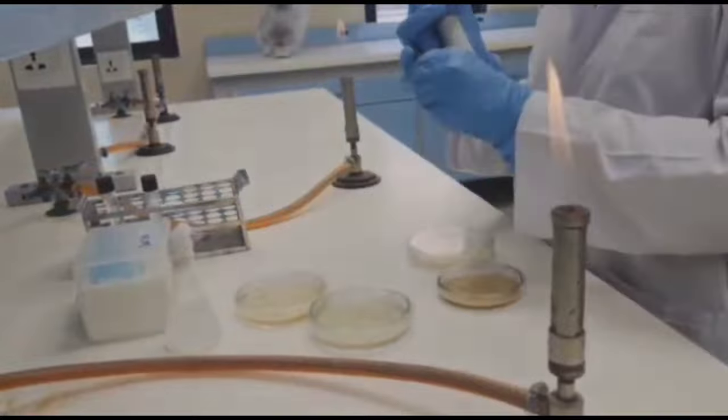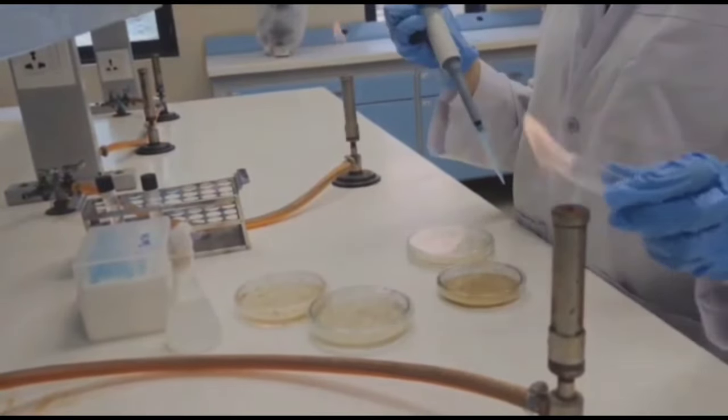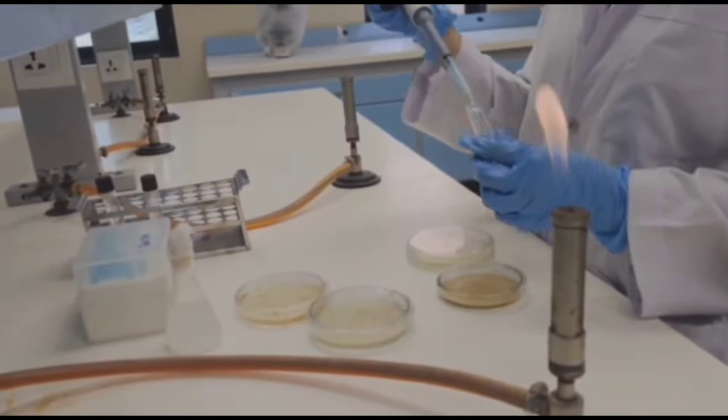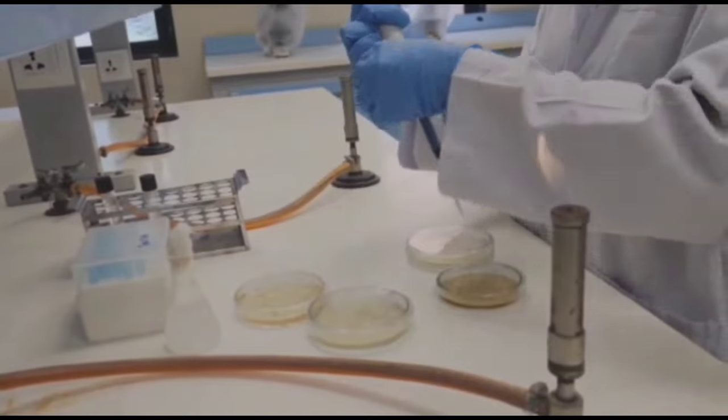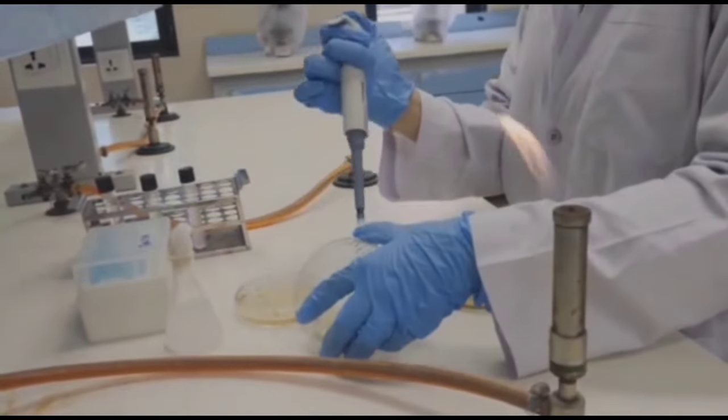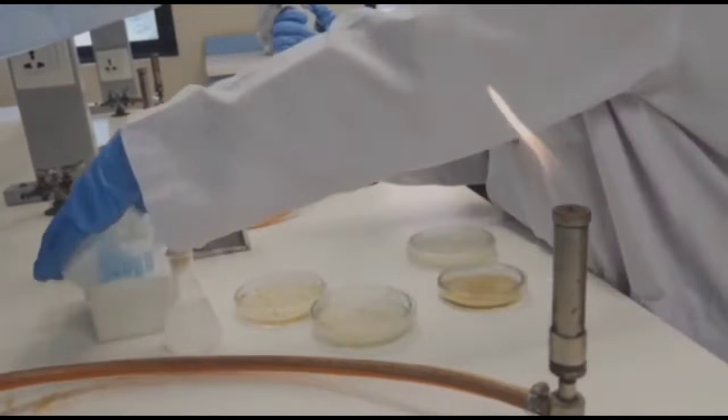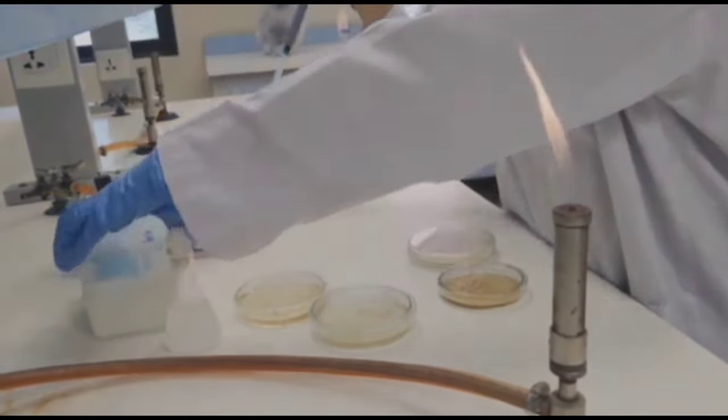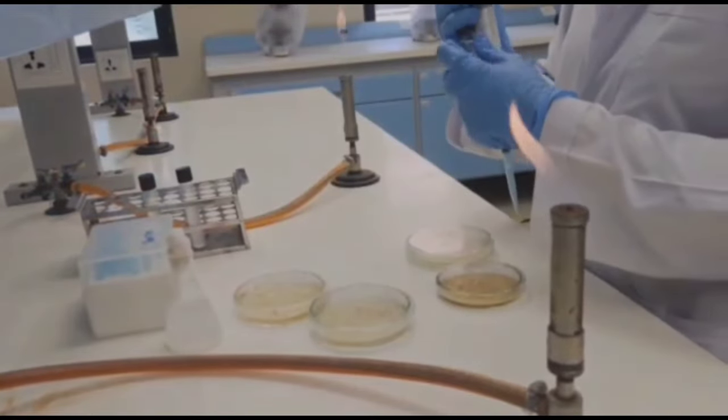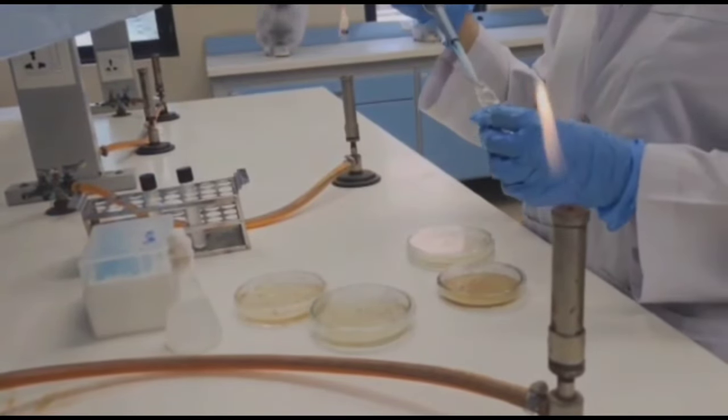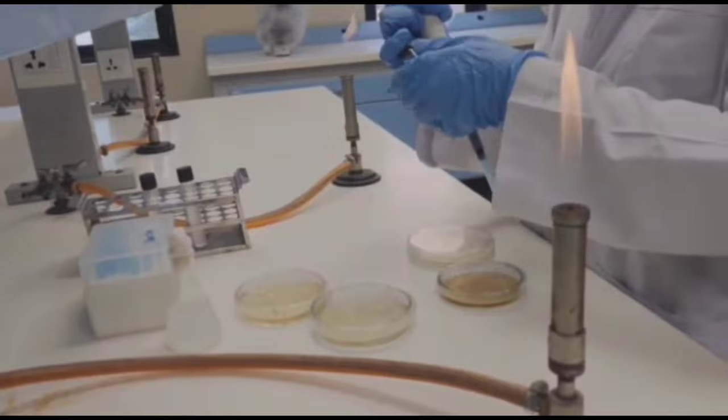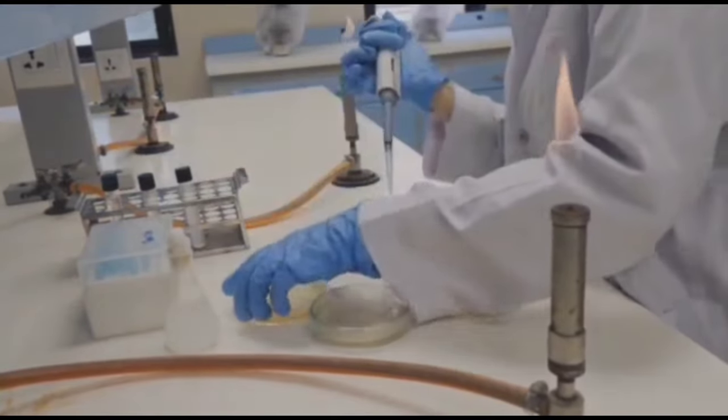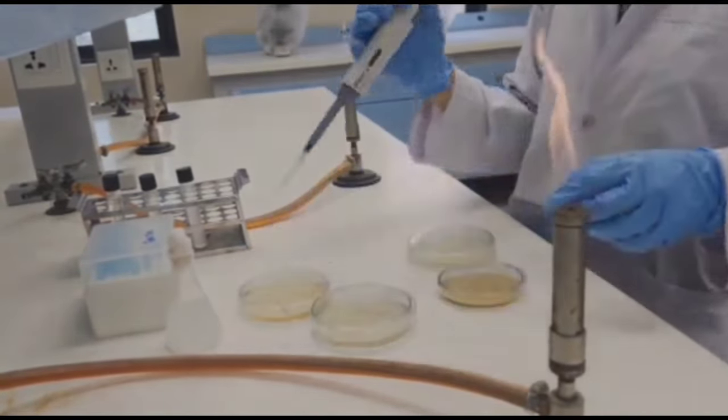After that we will change the tip of our micropipette and then inoculate second dilution into nutrient agar to check colony forming units in second dilution. Then we will again change the tip of the micropipette and then inoculate a solution of last dilution into nutrient agar to check the growth of colony forming units present in last dilution.